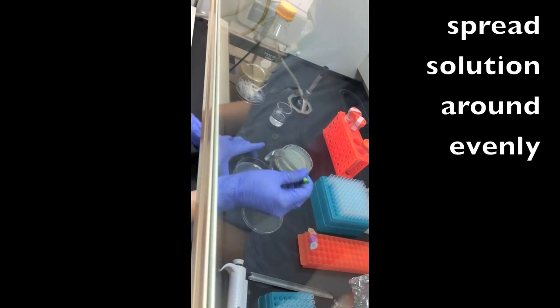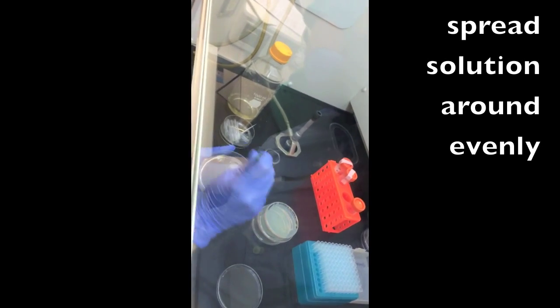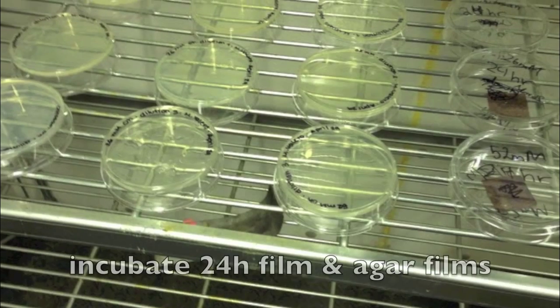We did three separate dilutions and we have a zero hour and a 24 hour control, which allows us to really understand the efficacy of our antibacterial films.